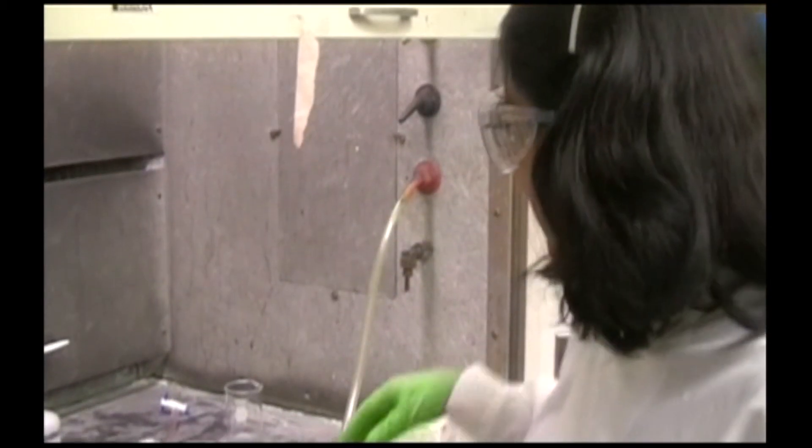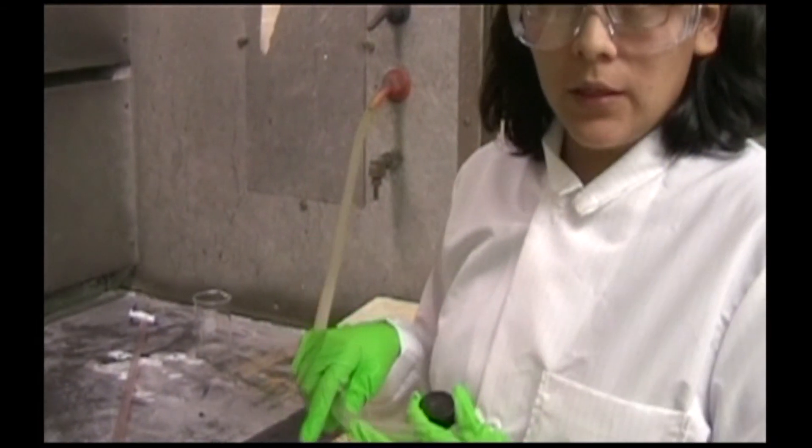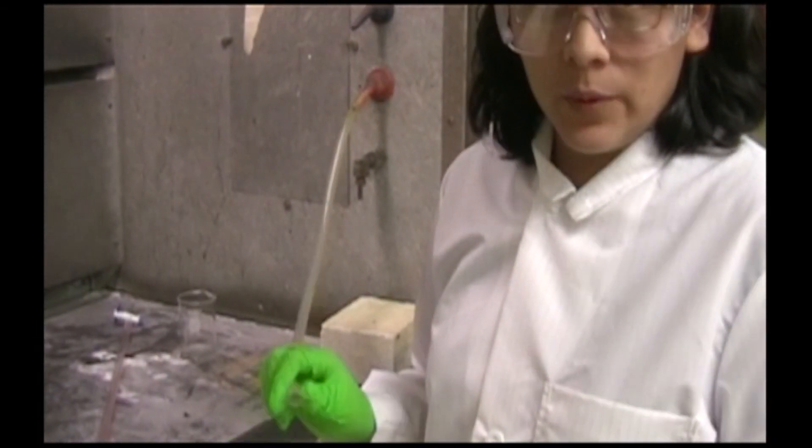To dry off your wet sample, you can use the house air if the sample surface doesn't need to be pristine because the house air is a little bit wet and dirty.